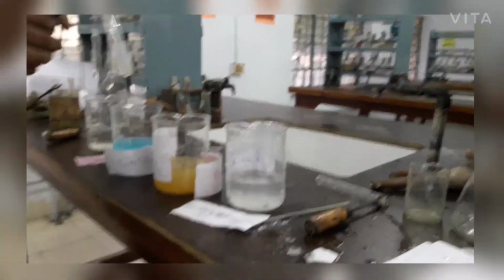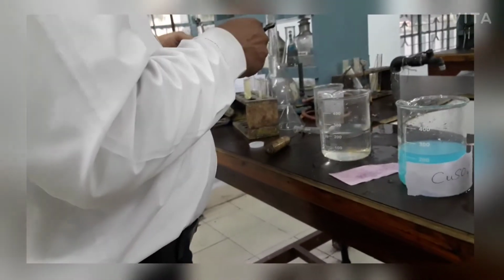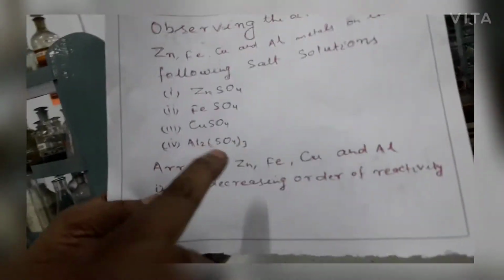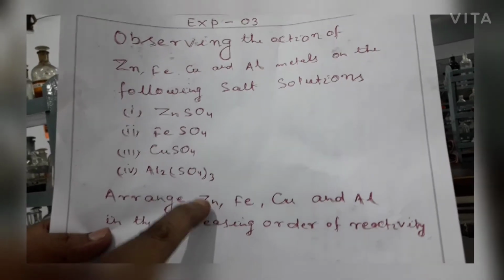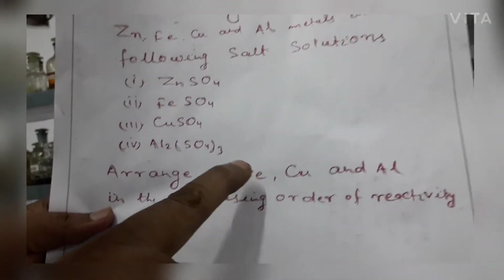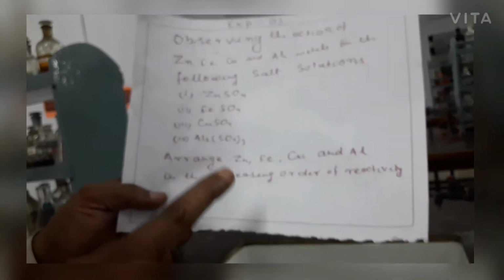So finally we can say that aluminium is more reactive than zinc, zinc is more reactive than iron, and iron is more reactive than copper.